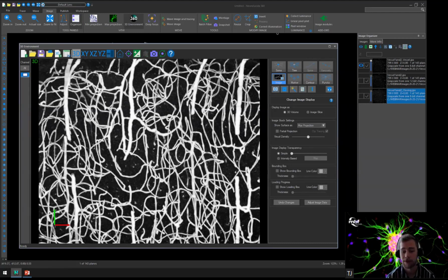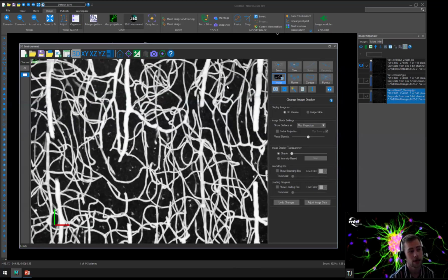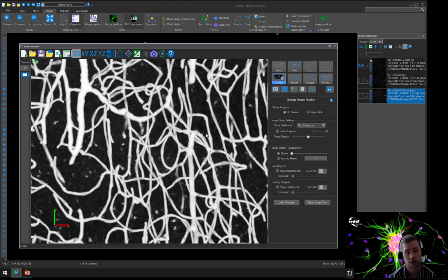the three-dimensional environment. A reason to use the vessel filter in non-vascular imaging, once again, would be if there seems to be a hollow structure where the algorithm isn't quite picking up the branches, or if there is just punctate staining throughout where you need to create a more uniform staining. That's where the vessel filter would come into play for those who are not in the vascular research field.